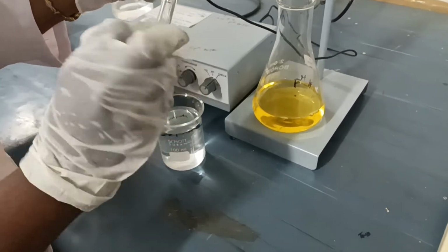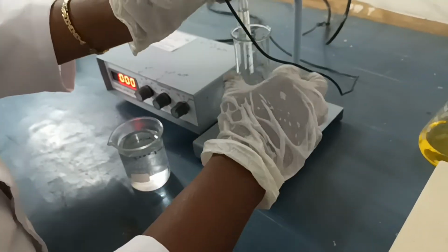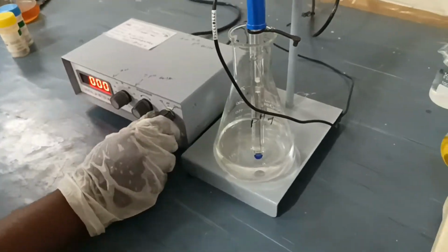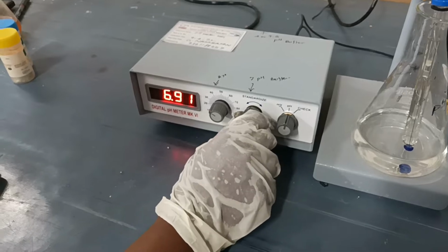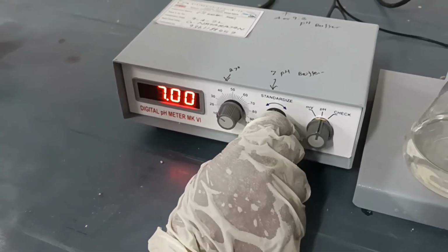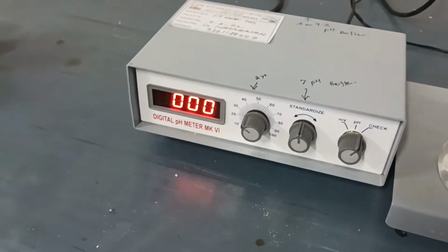Now the electrode is removed from the buffer solution. Wash the electrode with distilled water. Dry the electrode with tissue paper gently. Dip the electrode in the other buffer solution of pH 7. Rotate the function knob to check the pH mode. Adjust the pH using the calibration knob and finally go for checking mode. The checking mode display shows 0.